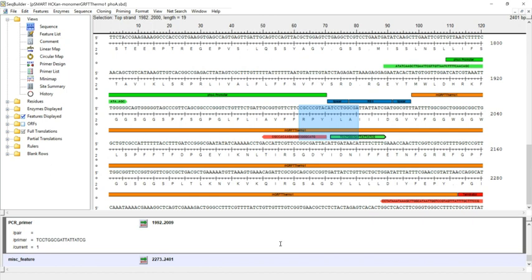Primer design is relatively simple as long as you keep in mind the resources that you have. It's relatively easy to design primers, and it never really works the first time. It'll take a few times of practice before you get it right, but it's a reaction that is carried out in just about every biology lab in the world. And quite frankly, it's very useful.